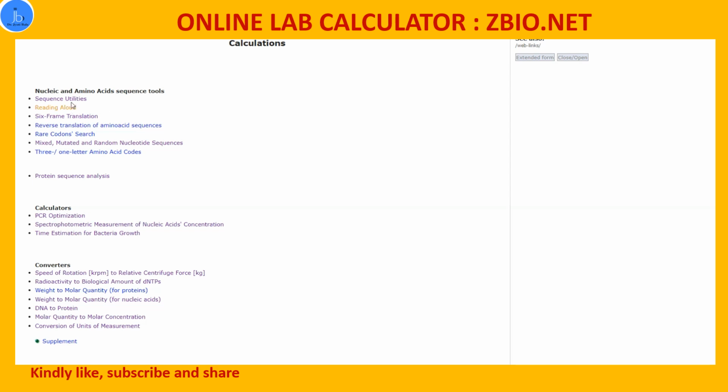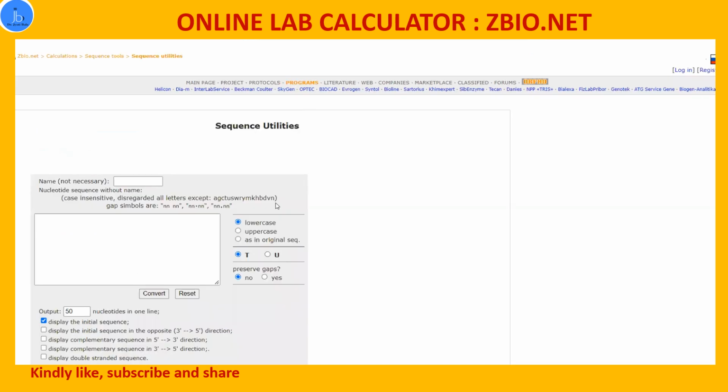So see here, for the nucleic acid and amino acid sequence, you may go to this sequence utility. And here you can see you just have to paste your samples. If you are handling nucleic acid, DNA or RNA, then you have to paste it. If sometimes your sample is in lowercase and you want to convert it to uppercase, then you can do those tasks.